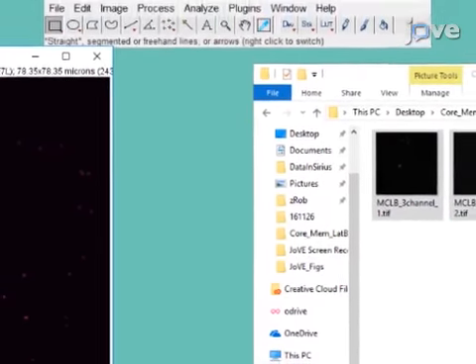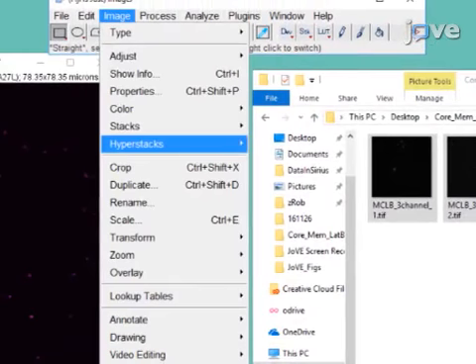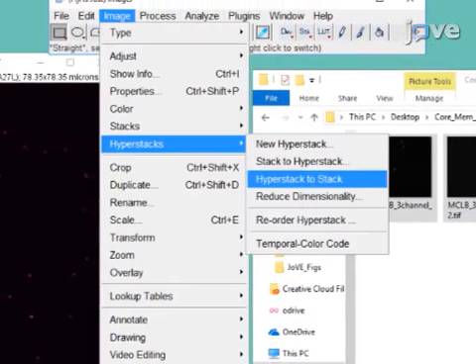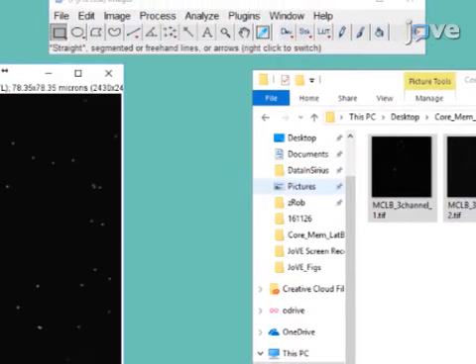If necessary, convert the concatenated image from a hyperstack to a stack.